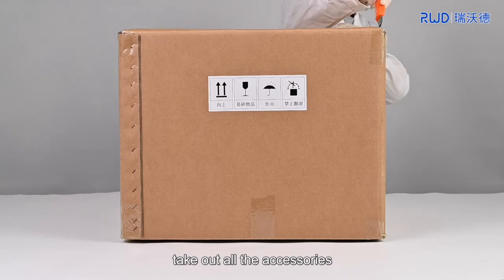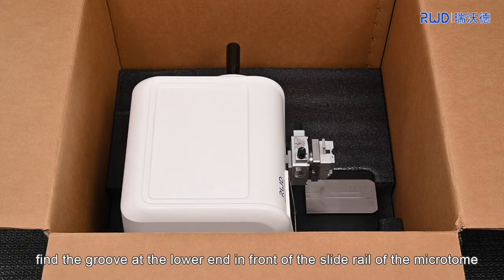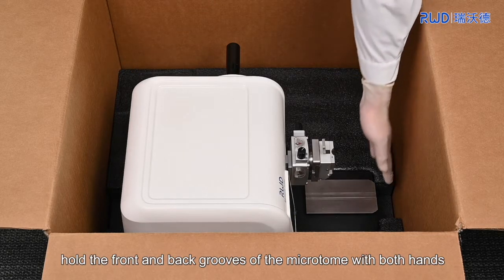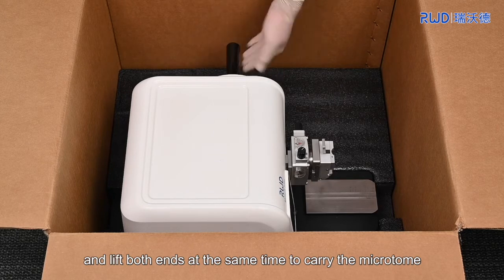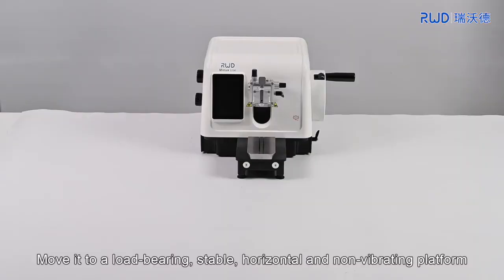2. After unpacking, take out all the accessories. Find the groove at the lower end in front of the slide rail of the microtome and the groove at the middle bottom of the back side of the instrument. Hold the front and back grooves with both hands. Aim the hand wheel at the chest and lift both ends at the same time to carry the microtome. Move it to a load-bearing, stable, horizontal, and non-vibrating platform.